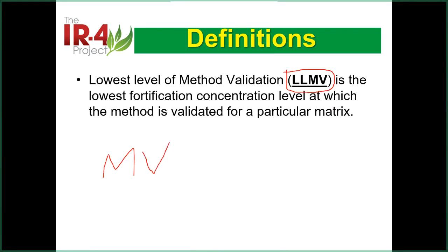Okay. So when we do that, that means I add 0.01 ppm concentration to the system. This is what I spiked in. So what kind of recovery is there? And if you calculate that, this LLMV is very close to or equivalent to LOQ. If you really calculate that, it's really close to, but it's a different definition.